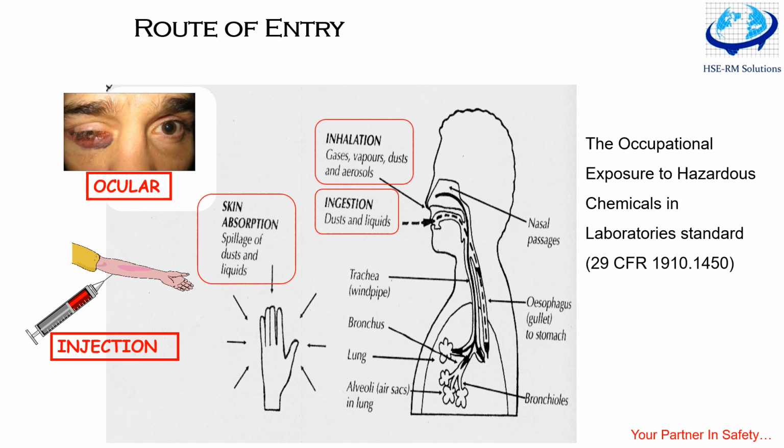And last but not least, inhalation. What do we inhale? Inhalation means whatever vapor is generated by any chemical goes inside your nose, so it goes to our sense of smell. When it goes to the sense of smell, our body processes that something is coming. So infectious aerosols can get into your body, vectors like mosquitoes and ticks can get into your body. That is one route of entry that needs to be very well protected.